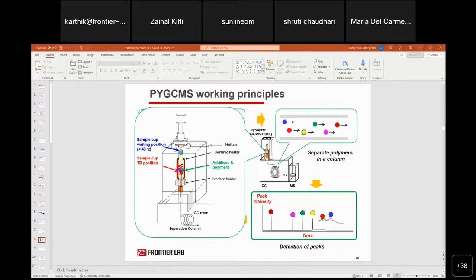When you have plastic particles, because this is actually for other polymer analysis but the point is the same, you can just transfer your particles into the sample cup. Then the sample cup is transferred to the furnace. When you start the analysis, the cup drops into the furnace where the temperature is set high.